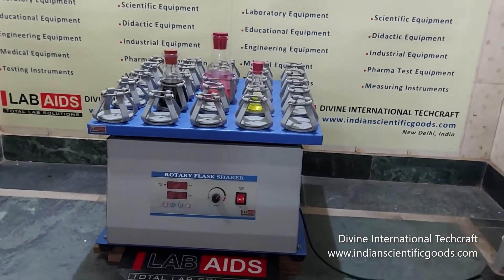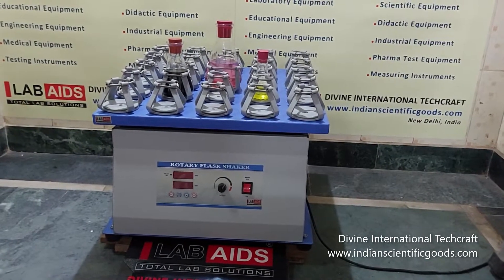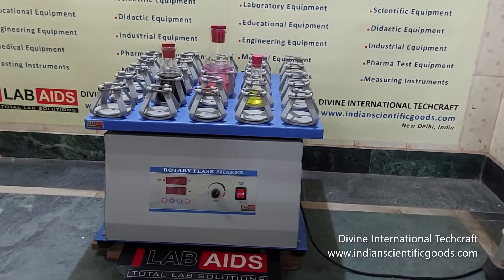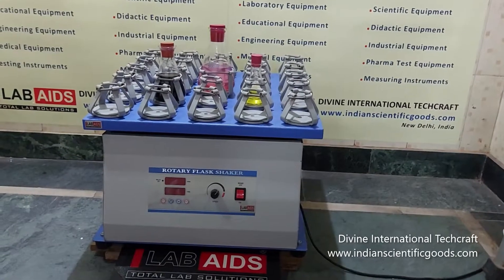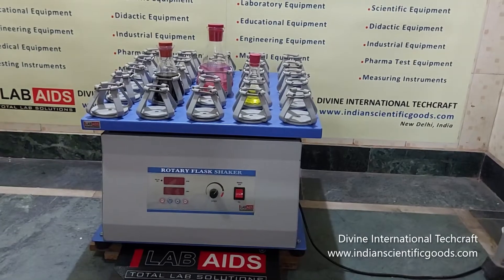Rotary flask shakers are ideal for mixing and development of cultures, chemicals, solvents and assays, in microbiological, cell culture, and chemical and life science laboratories. These are used for shaking liquid samples in conical flasks from 50 to 1000 ml capacity.